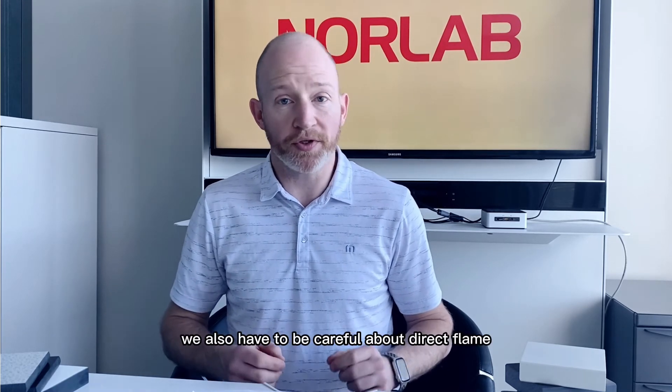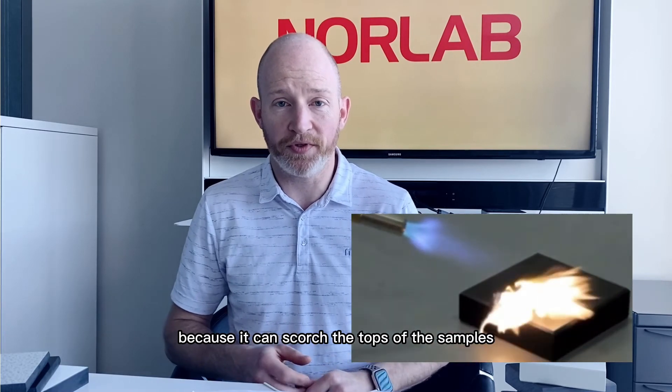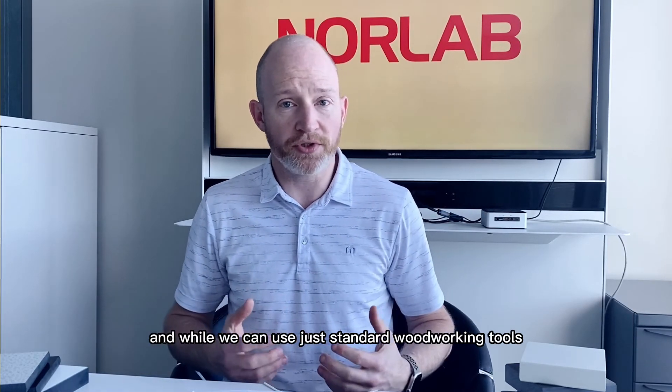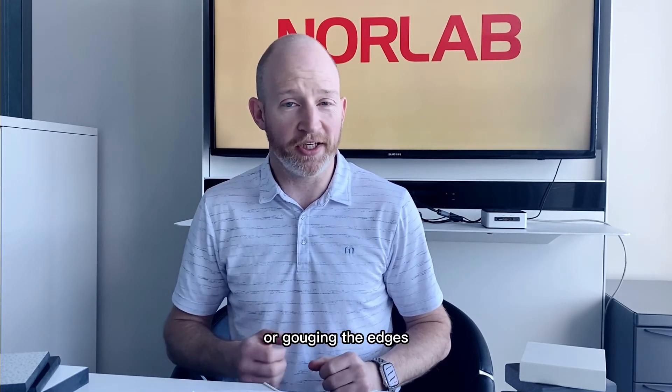While phenolic panels have very good abrasive qualities and impact resistance, we have to be careful about gouging and scratching because those cannot be repaired. We also have to be careful about direct flame because it can scorch the tops of the samples and cause long-term damage. When machining, standard woodworking tools can be used but they must be sharp, otherwise you'll end up chipping or gouging the edges.